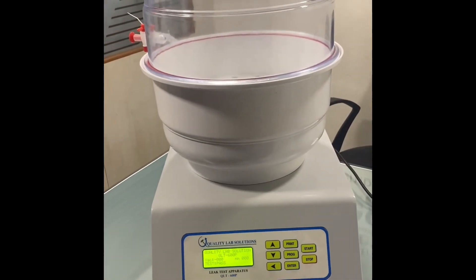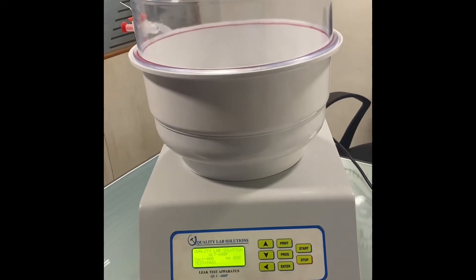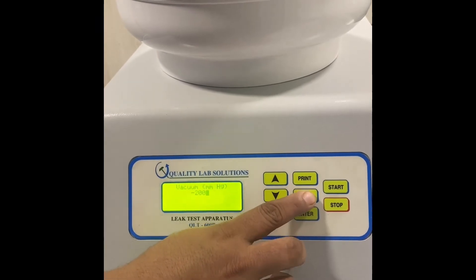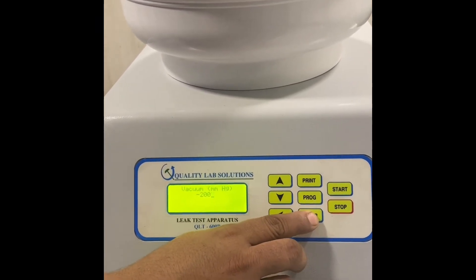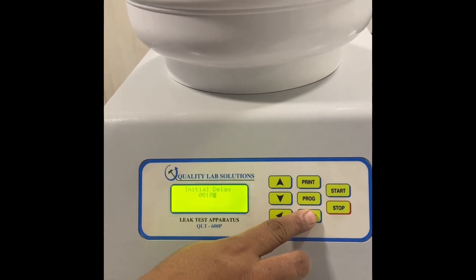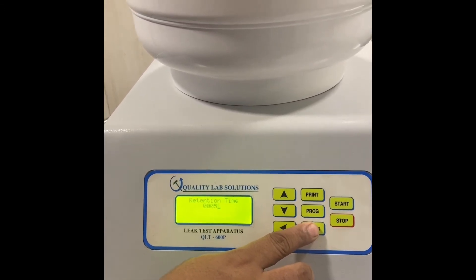We will be starting at the 200 level. We will be doing a small program: vacuum set at 200, hold time at 20, initial delay 10, retention time 5.